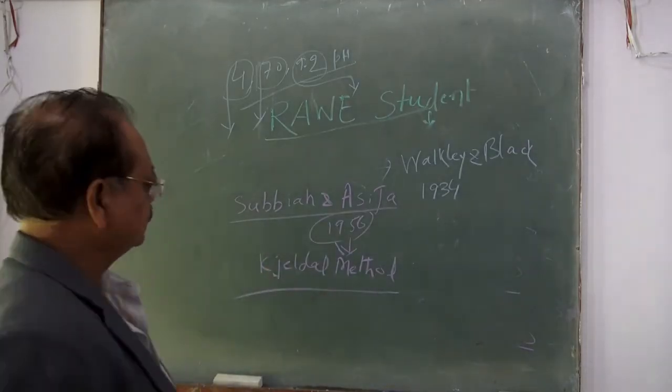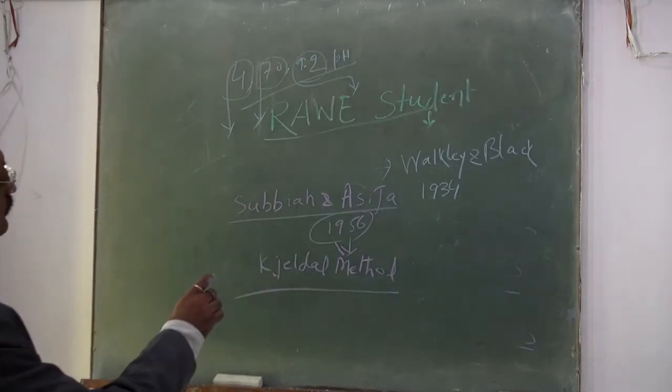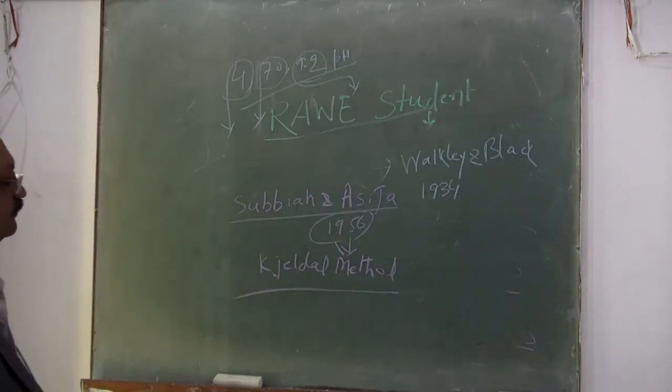With the help of this Kjeldahl method, you can determine the nitrogen content of the soil.